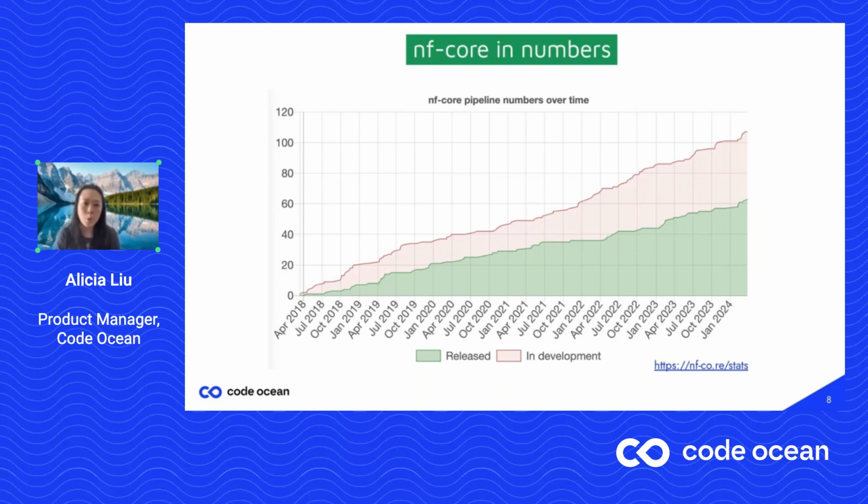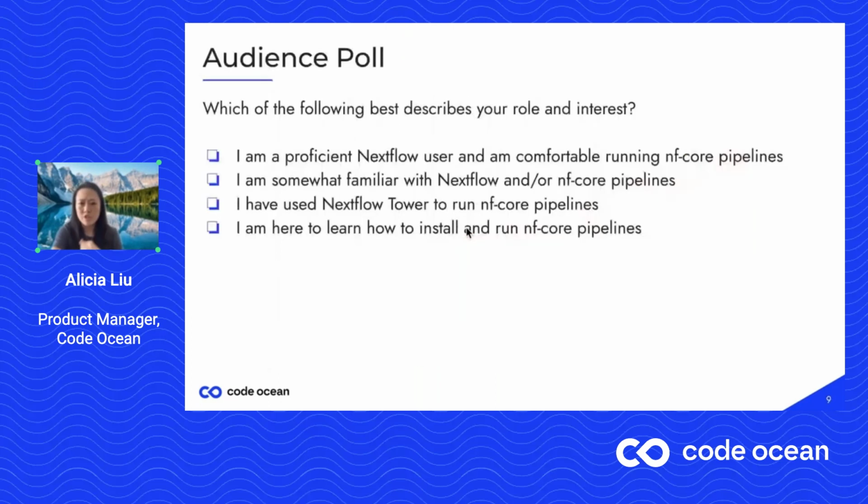So now, before I move on to the next segment where we dive into how we make that happen, we're going to pause for a quick audience poll just to get a better understanding of the expertise and interest of our audience today. All right, and we'll go ahead and close the poll.